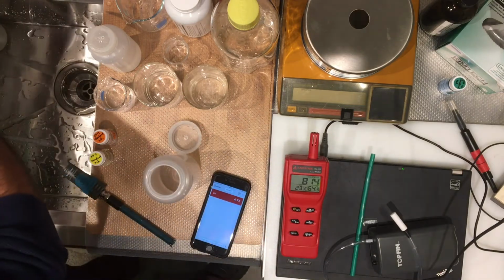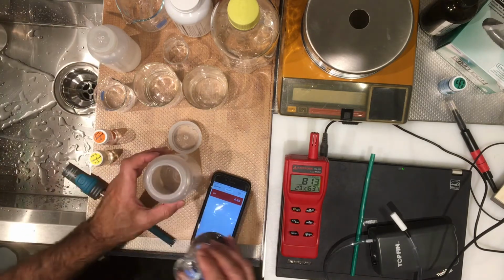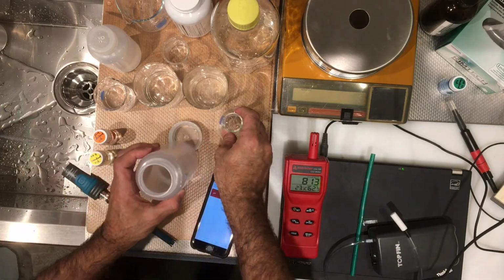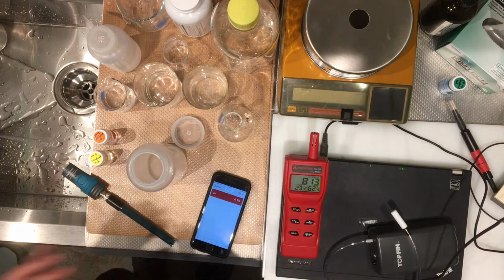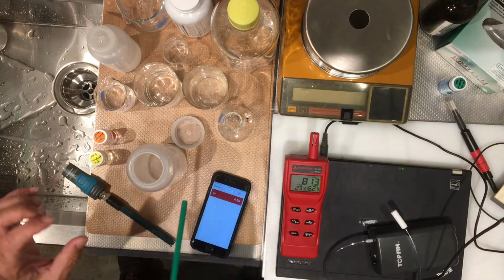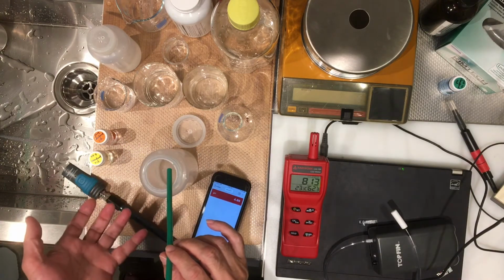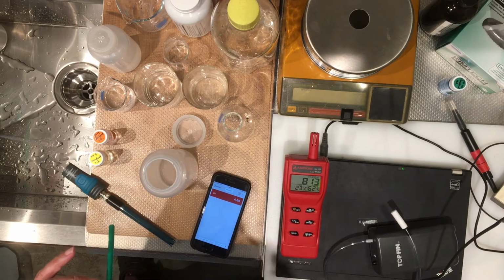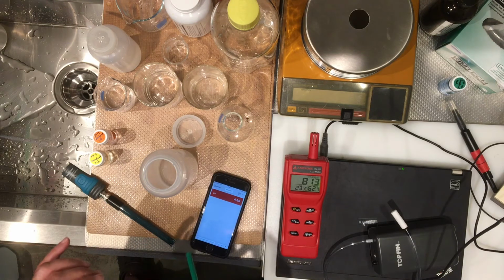I measure 100 milliliters of deionized water, pure water, and I pour that into this plastic container. And then I hold my breath. So I'm going to take a deep breath and hold it, and I'm going to blow into this container, replacing this air with my exhale after I hold it for as long as I can. So obviously we should be able to see a lot more carbon dioxide level on that. So there we go.